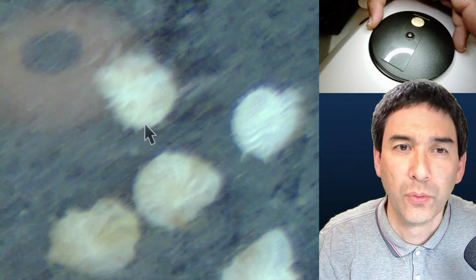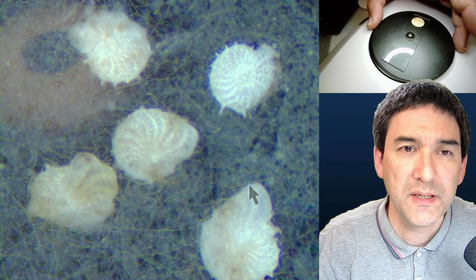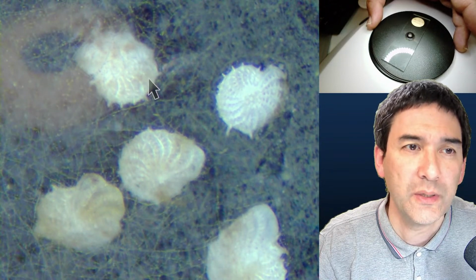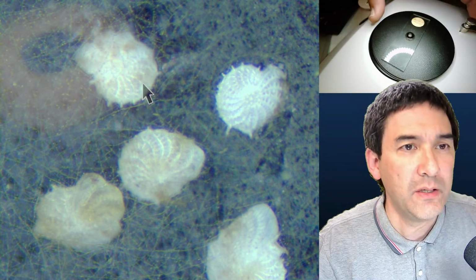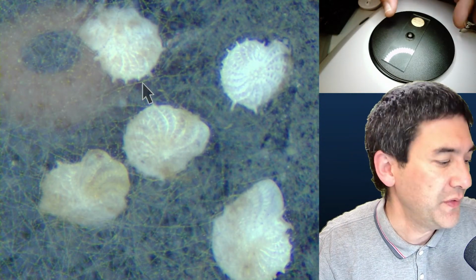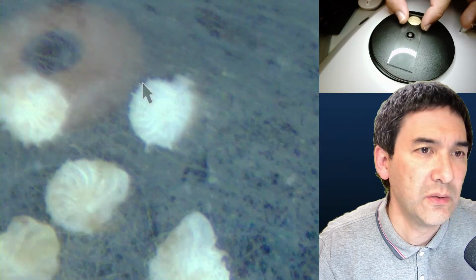Yeah. So these are foraminifera, which basically, I also did not quite anticipate. By the way, another interesting thing here. I also wanted to show this. It's a little technical thing. Let's put this away here. And no, let's put it still on here.